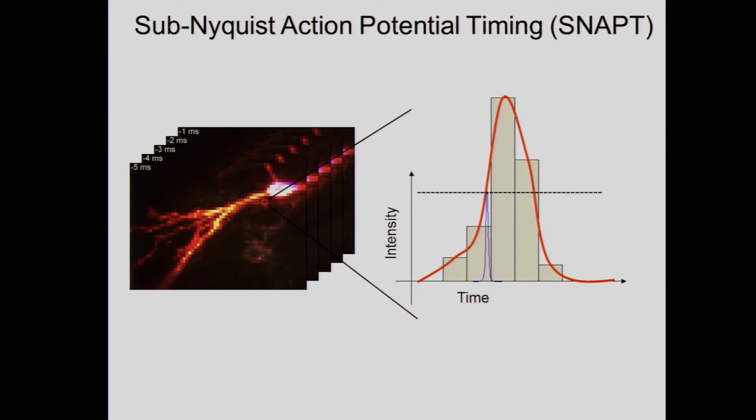So you can think of this as a model-based fit. This is qualitatively similar to a time domain version of the point spread function fitting, which is the basis for super resolution imaging in the spatial domain. Okay? So we do this fit independently at each pixel in the movie. And then we make a new movie where we light up each pixel only at the time corresponding to this interpolated timing. So we can make a movie showing the propagation of the wavefront through the sample.